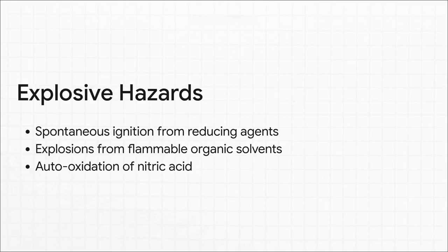And then you have explosive hazards. Now, this isn't always about mixing the wrong things together in a dramatic boom. It can be way more subtle than that. For example, something as simple as drying a reducing agent, like zinc powder on filter paper, can actually cause it to spontaneously burst in flames. Or just mopping up some concentrated nitric acid with a cotton cloth can cause it to ignite all by itself. These are the kinds of reactions you have to see coming.